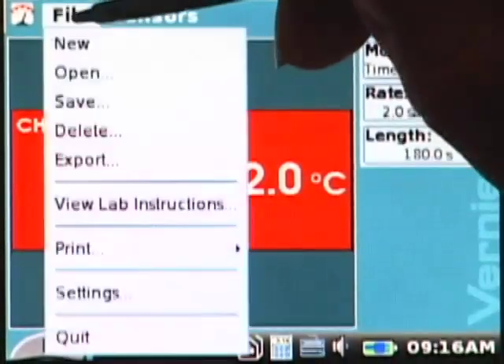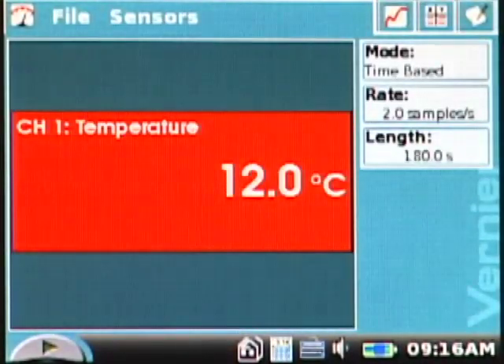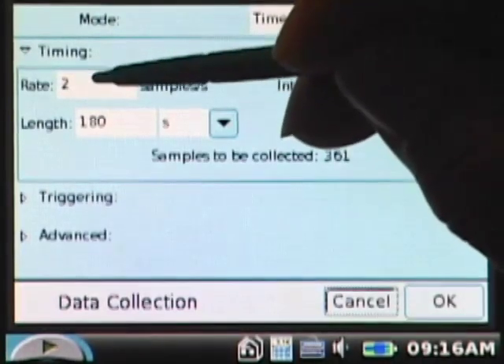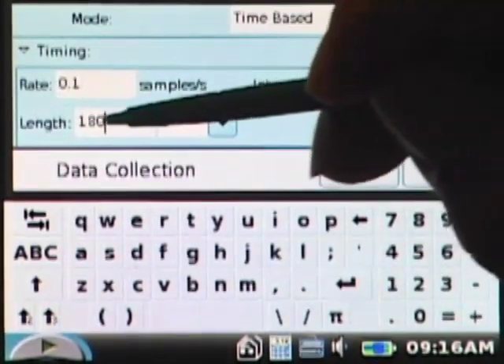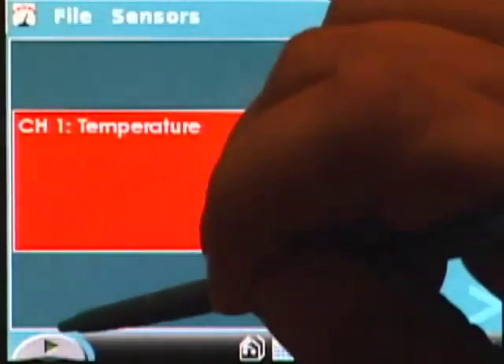Choose New from the File menu. In this experiment, we need to change both the rate and the length of data collection. To do this, tap on the word Rate on the meter screen. This brings up the data collection dialog box. Change the rate to 0.1 samples per second. Change the data collection length to 900 seconds. Tap OK, and start data collection.